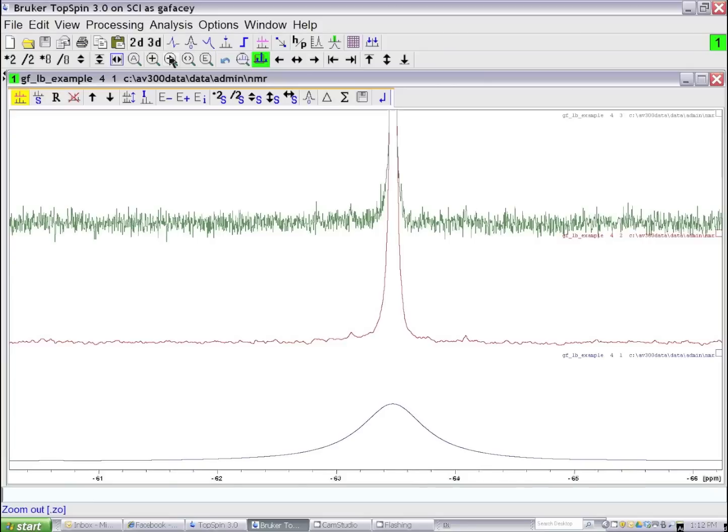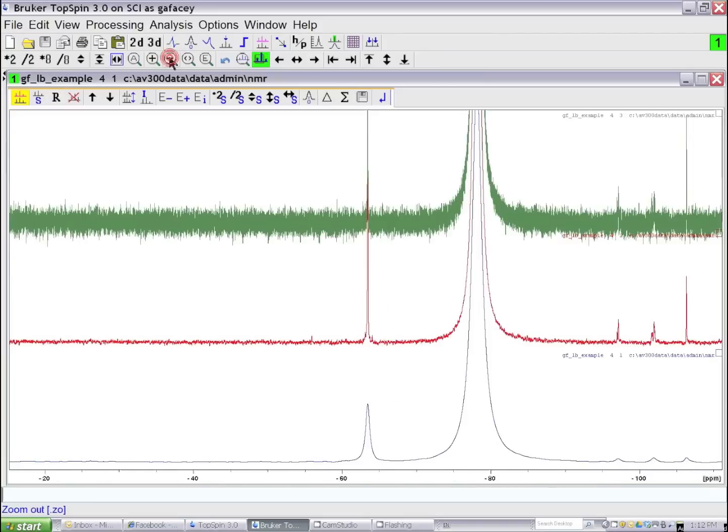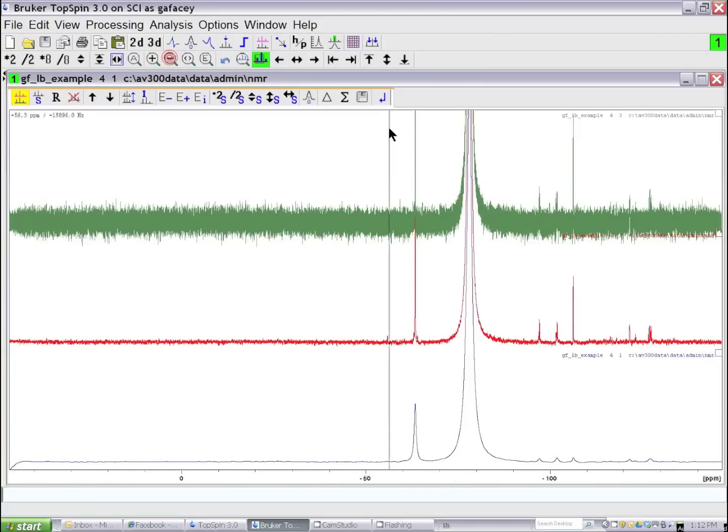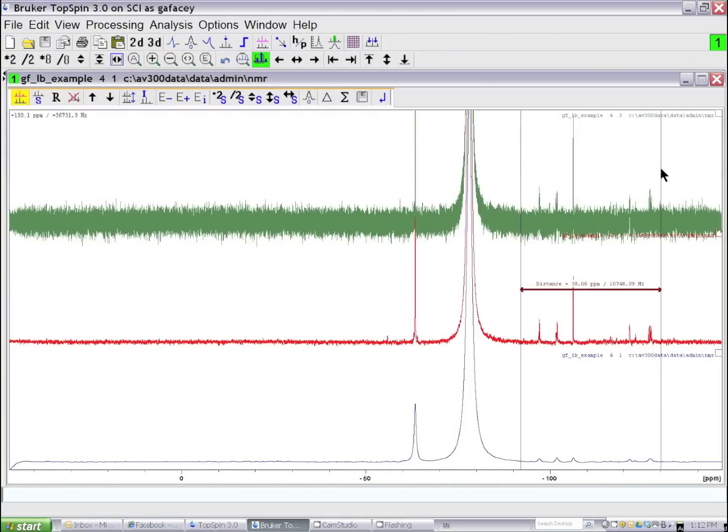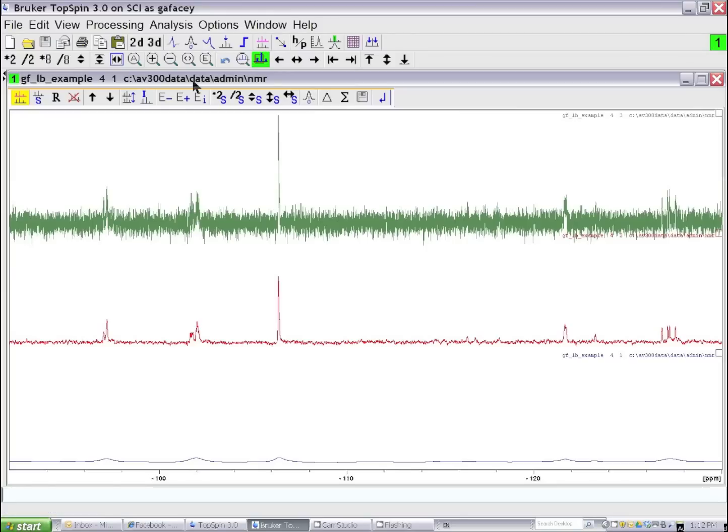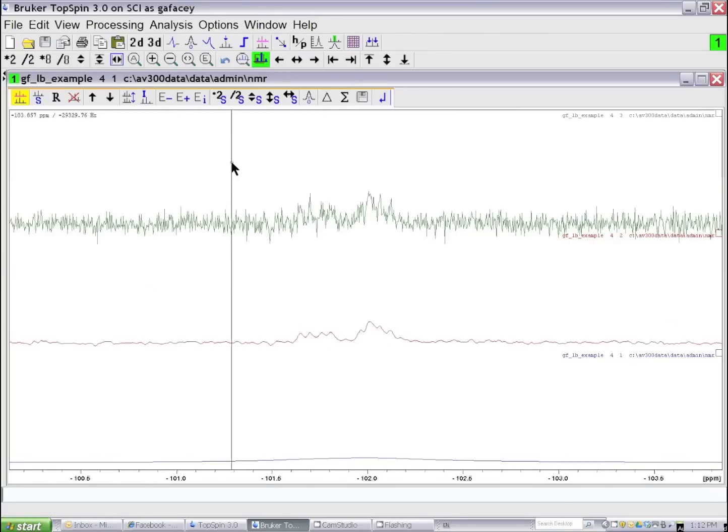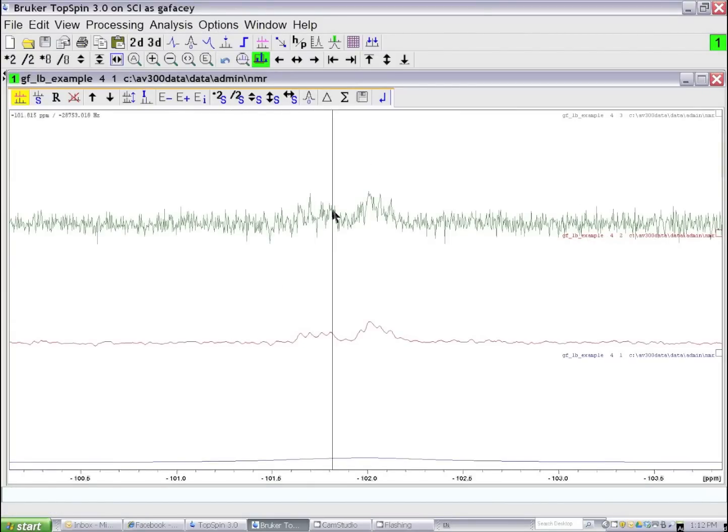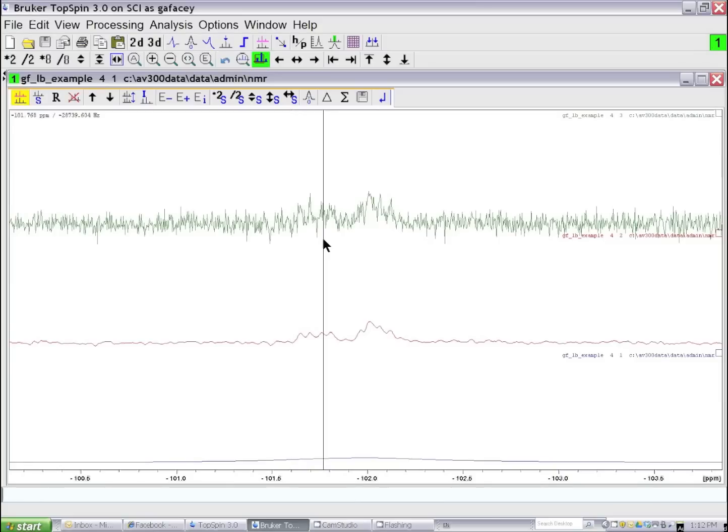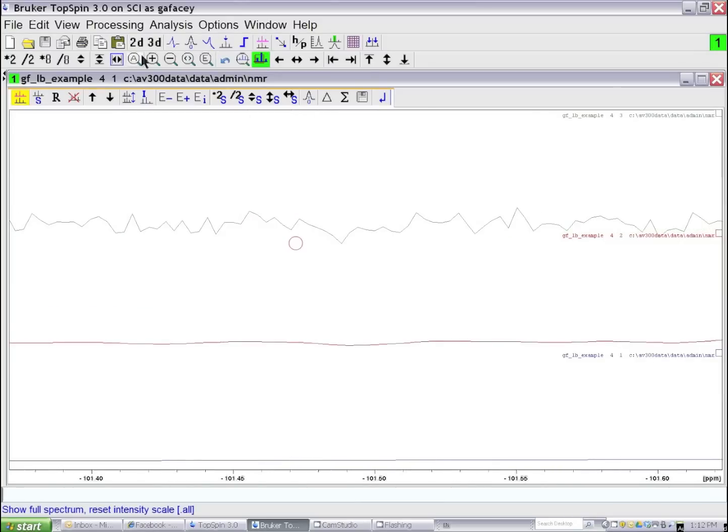If we look at the low-intensity region of the spectrum and blow that up, and in particular let's look at these resonances in this region, we can see that with no exponential line broadening in this case, all we see really is noise in the NMR spectrum.